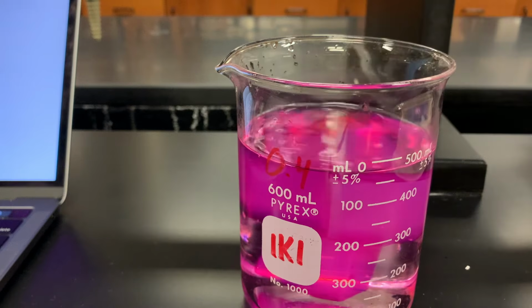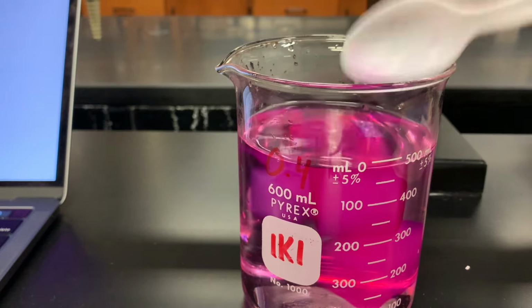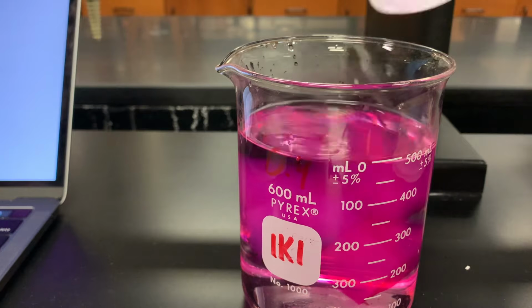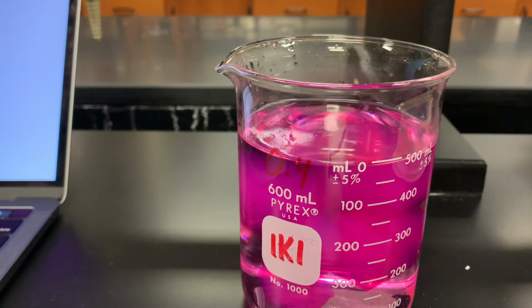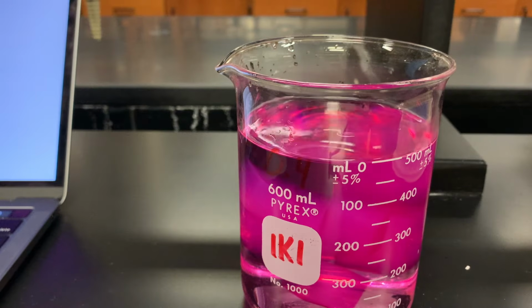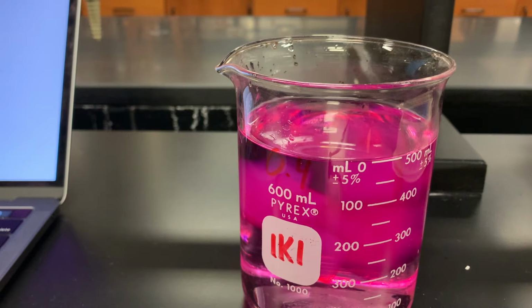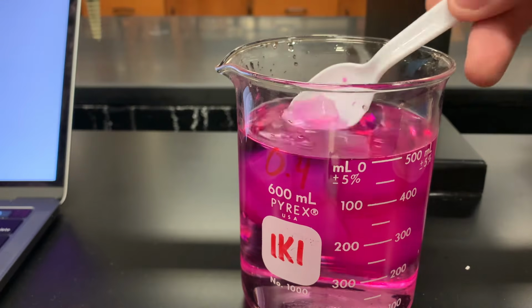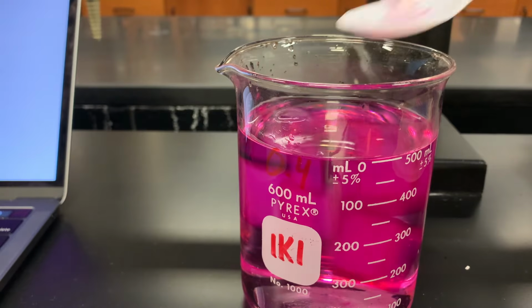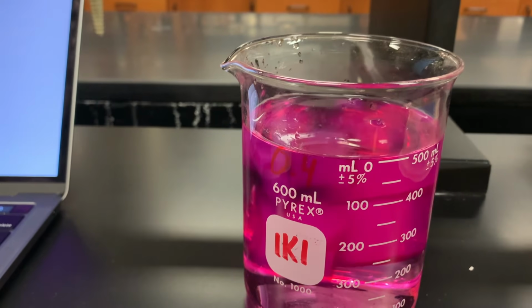Okay. And if you notice, they are turning this pinkish color. What I did here, whenever I was making our agar cubes, is I put a base indicator in them. It's called phenolphthalein. So in the presence of a base, it turns this pinkish purple color. So what this tells us is that sodium hydroxide, NaOH, is a base. Okay, so they are in there.